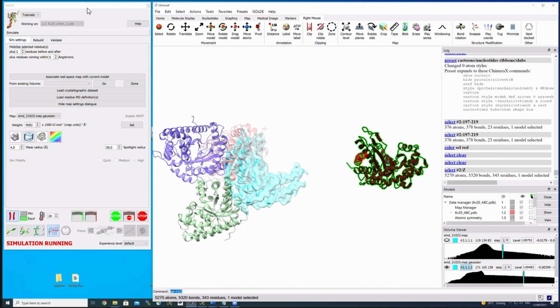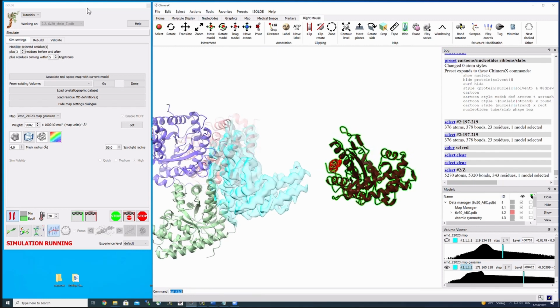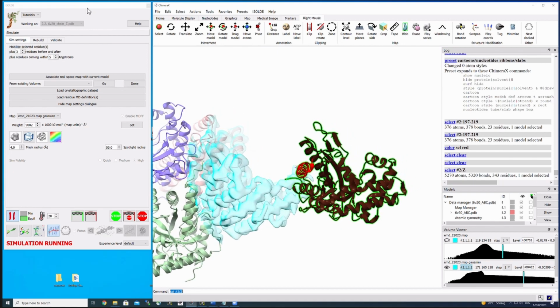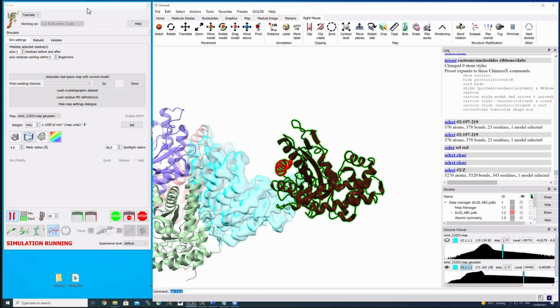And if we have done that, we can use the tug command, which is down here. It says tug the currently selected atoms. By clicking that and then using the right mouse button, I can actually start moving that domain within the simulation. And notice that the domain stays together because of the restraints. You don't see them acting now so much, and that is because we are using the representation of the cartoon.